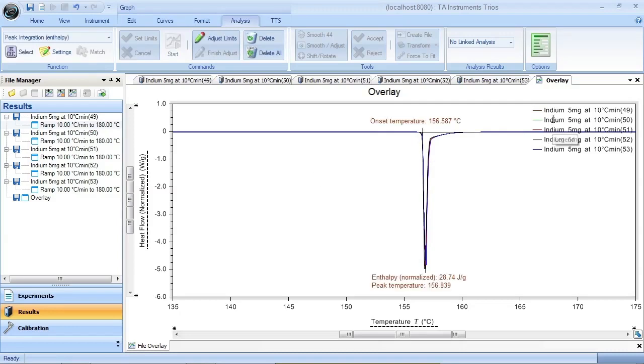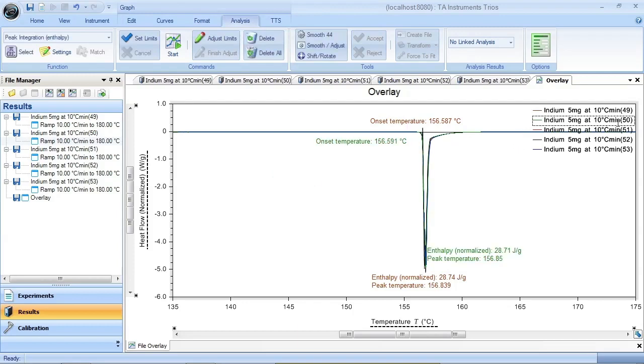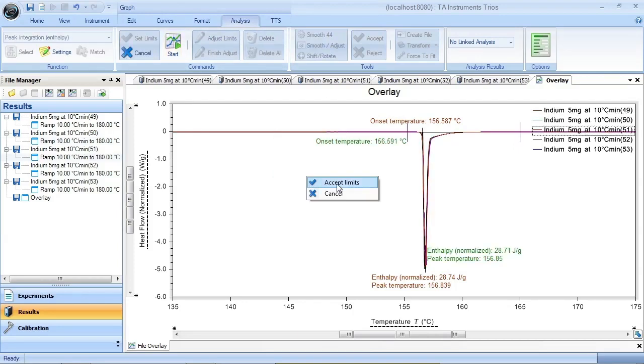And when I want to do the next curve, I just select the curve in the legend, say Set Limits, and you notice it goes right back to the same spot. That's what you want. So you just click on the curve in the legend, say Set Limits, and then right click and say Accept.